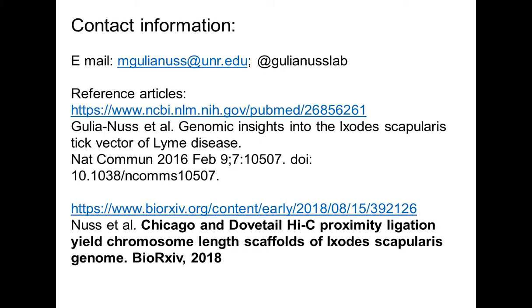One other quick thing is that Hi-C really requires an input N50 of a megabase or higher. So the 20 kb metric is strictly for Chicago. If you're attempting to do Hi-C on an input assembly with a scaffold N50 lower than a megabase, it's not nearly as likely to get you full chromosomes than if your input N50 was a megabase or higher.